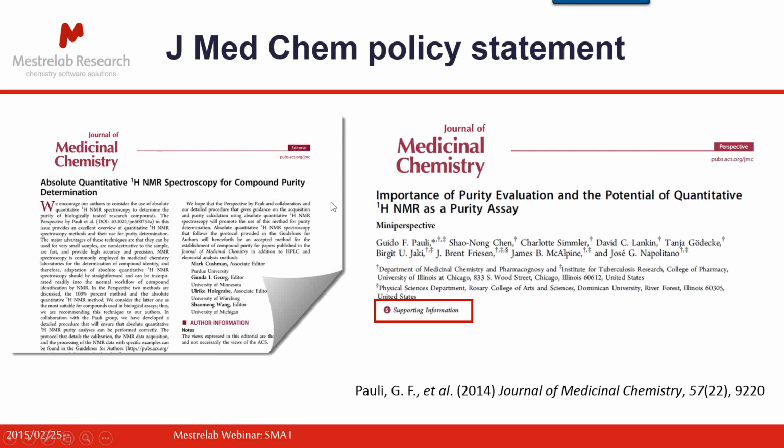Now, along with this editorial is a very nice perspective paper by Guido Pauli's group, and this is the reference to it over here, and it's in the same journal issue. I noticed that there's some supporting information here, and amongst the SI you'll find some Mnova files which you can use to try these out. And in fact, I'm going to use them today. I'm going to use 2 of them today. So 2 of my data sets come exactly from this paper; I've just lifted them straight off and used them straight away. Okay, let's dive in now.